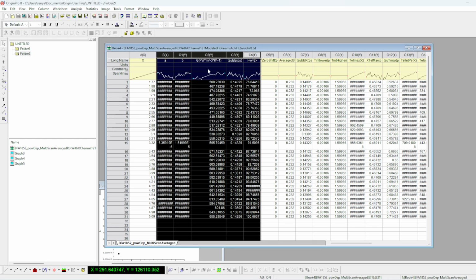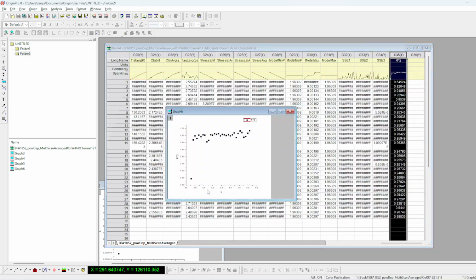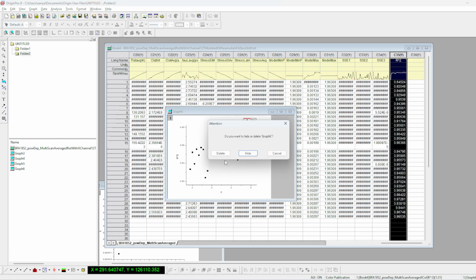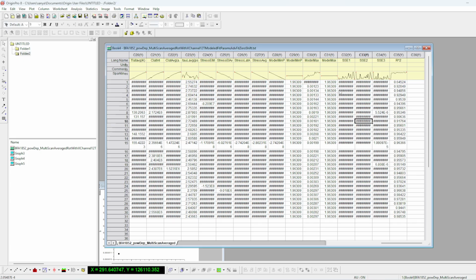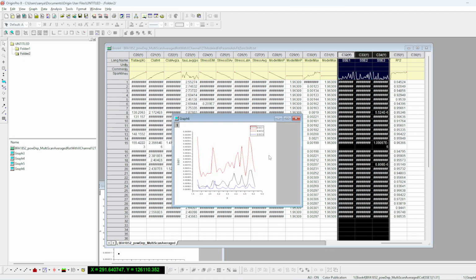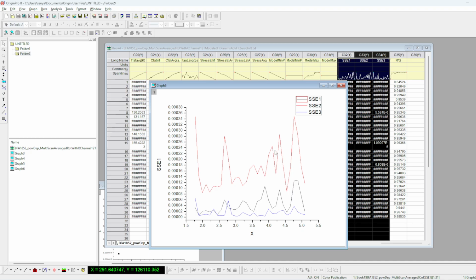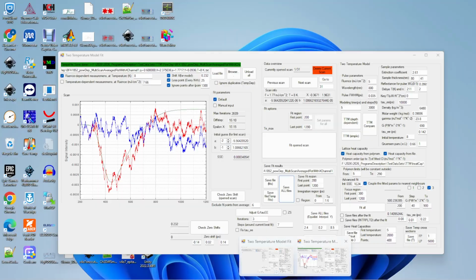Additionally, out of these 4 parameters, there are some calculated properties like R-square, which is the goodness of fit. You can see that the first fit was not really good. The rest is all above 90. So if you want to delete some fit, you're interested in that, then you have 3 different sum of square errors. There are sum of square errors in different regions of fit, in all focus region, in different parts of regions. Let me show you.